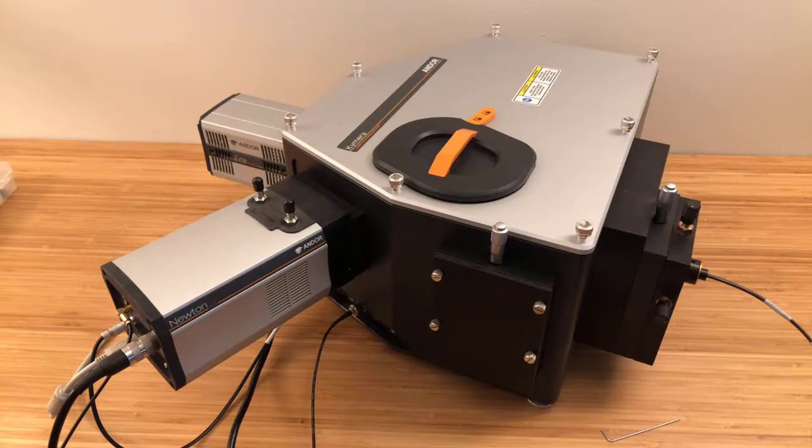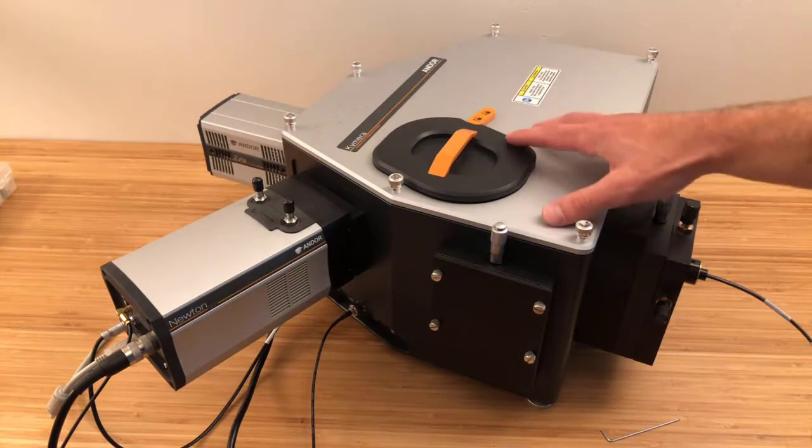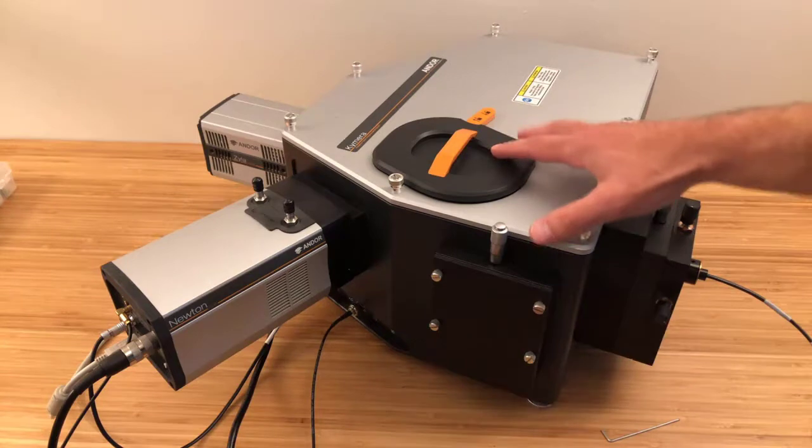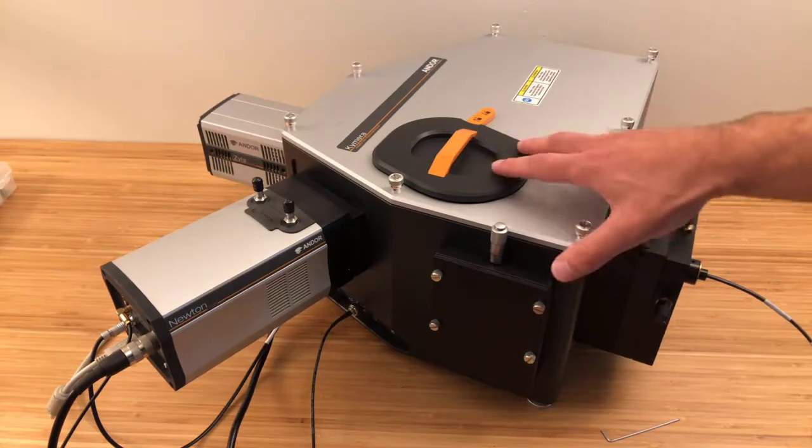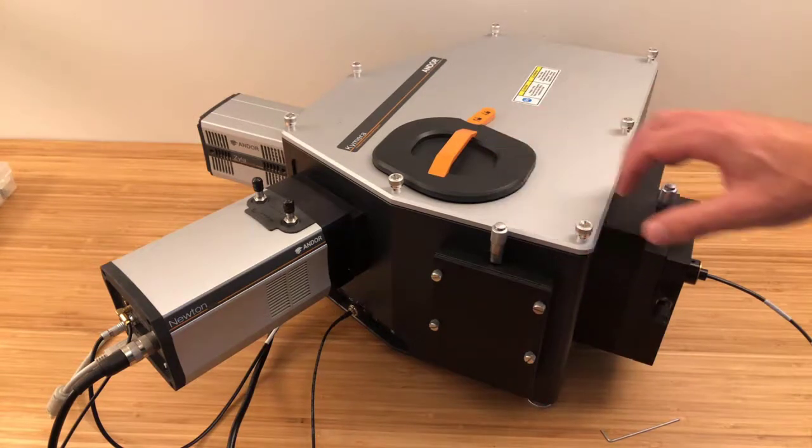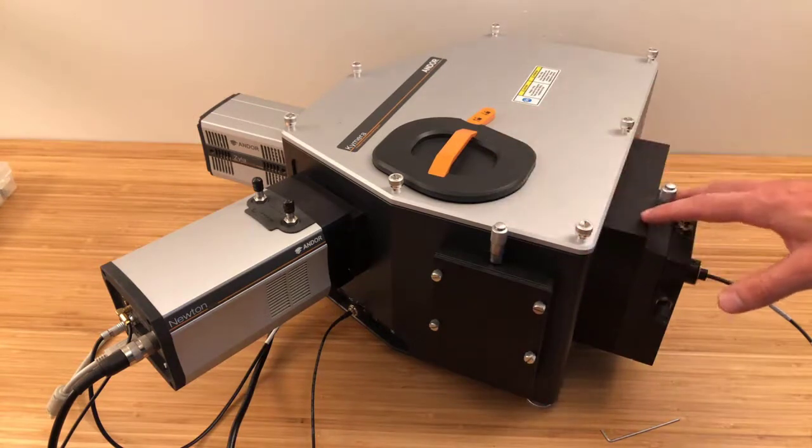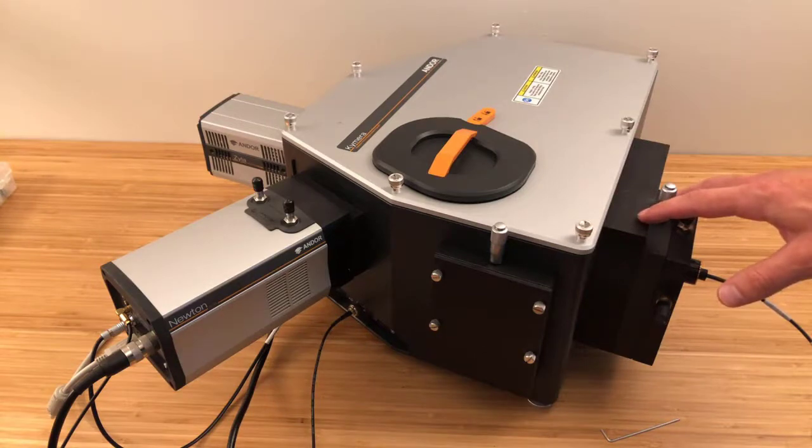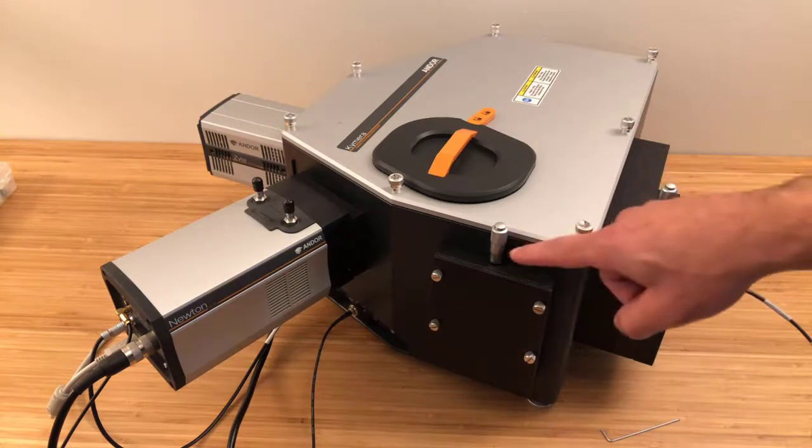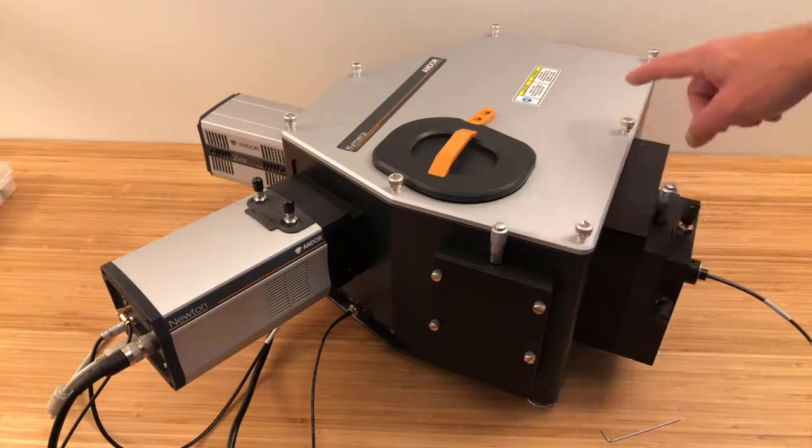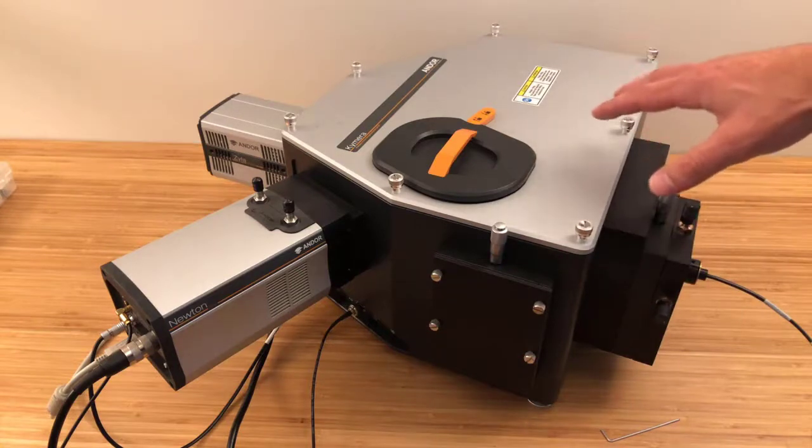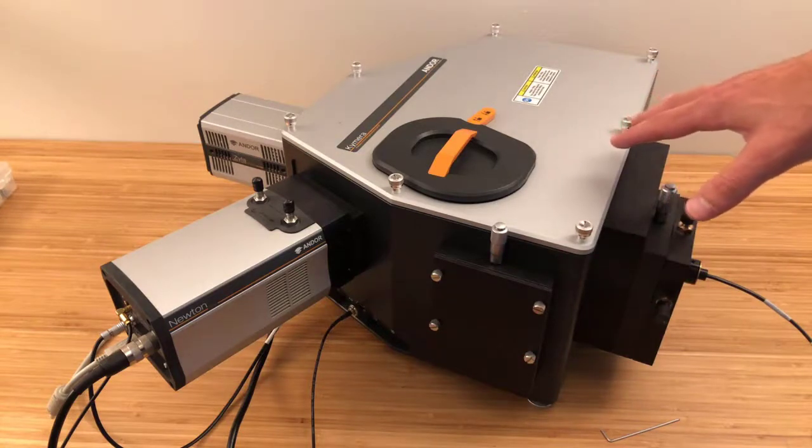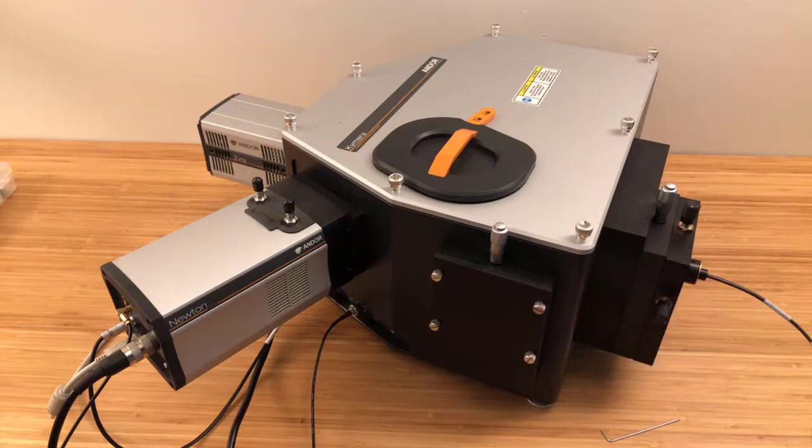First, let me show off the hardware. This is the body of the spectrometer. So this is the chassis, quite heavy and stable. And on here, we have the input ports. This is where we bring in the light. This is the direct port, meaning it goes directly to the mirror, and I'll show you some more about that shortly. And this is the side port.